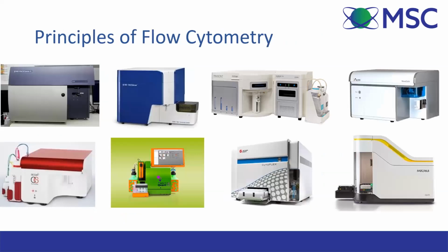So many companies have many different models of flow cytometer, and these can vary widely from small compact units with 3 or 4 colors to large analyzers which can handle over 20 colors. There are also sorters which can isolate very specific populations or single cells, and there are even imaging cytometers which can combine the throughput of flow cytometry with the in-depth information of single-cell microscopy. Possibilities are vast, but whatever cytometer you end up using in the lab, the basic principles are largely the same. As well as this, the reagents you can buy are generally compatible across many different cytometers.